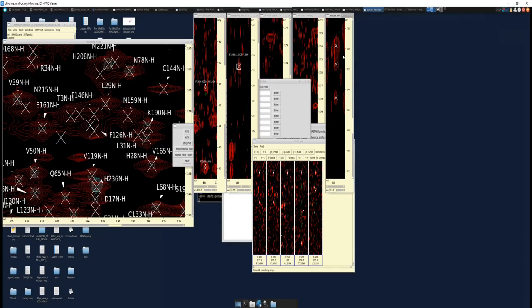Additionally, say you want to run strip plots for your NOESY and HNCA. In many cases, maybe you don't have C-betas. And as I will show you, HNCA and NOESYs can actually be enough to assign your entire protein sometimes, depending on the quality of your data.